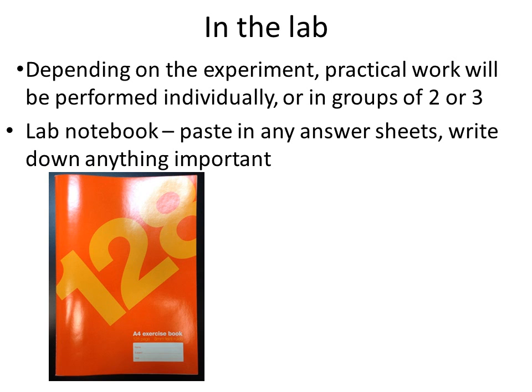You'll be given a lab notebook that looks like this. You must record all your data in the notebook, including pasting result sheets or printed spectra, and write down anything that is important. If you want to query a mark or ask a question, you must bring your notebook with you so that we can check what you actually did in lab.